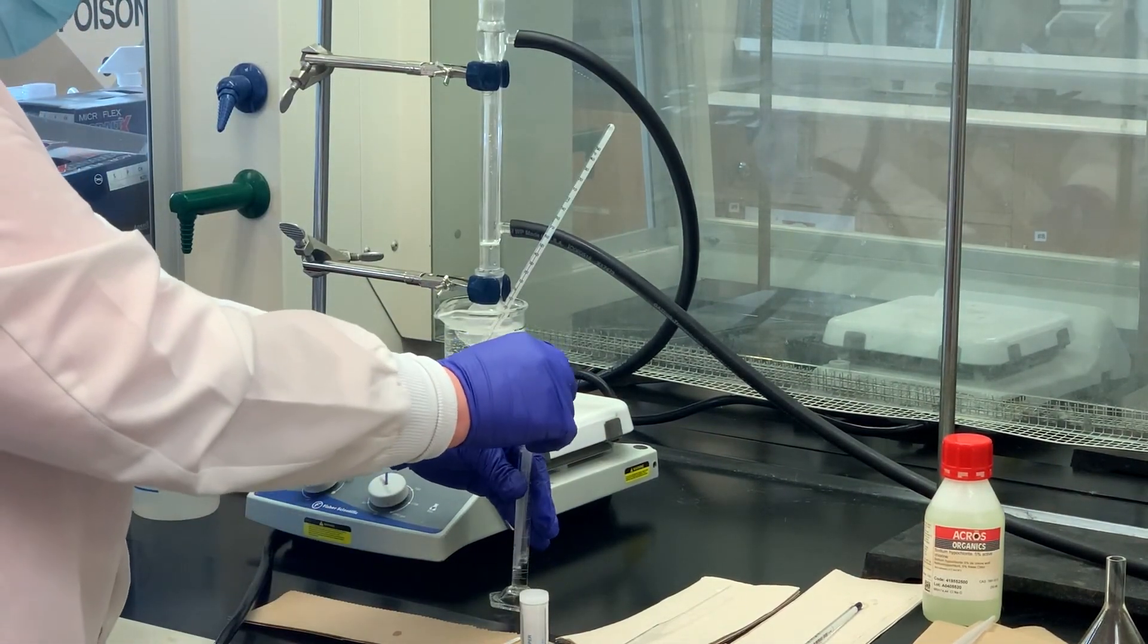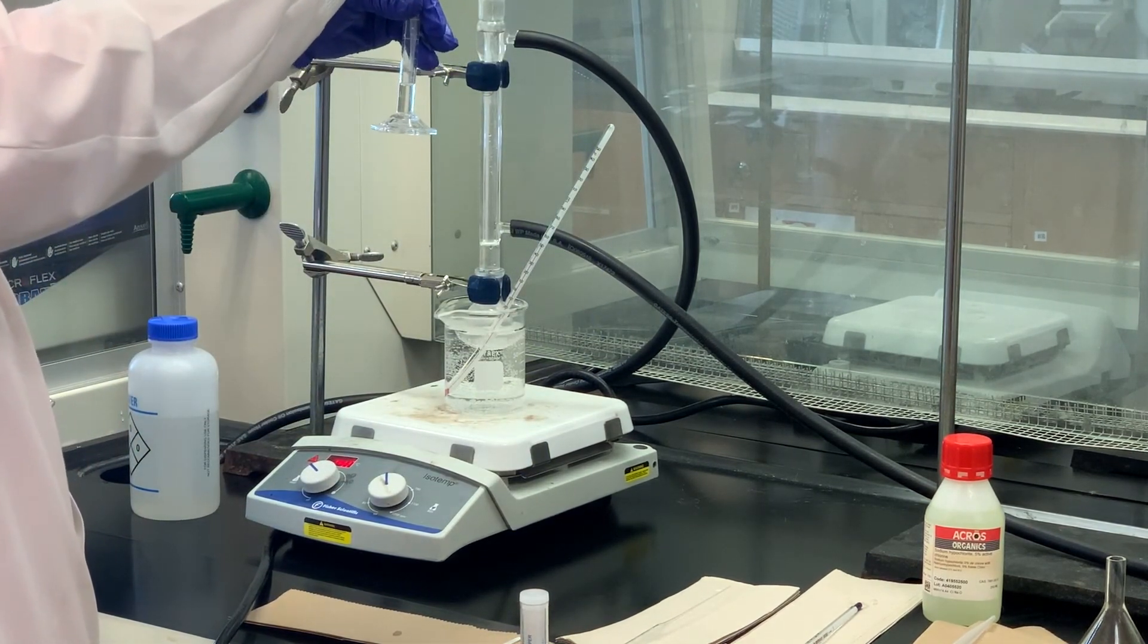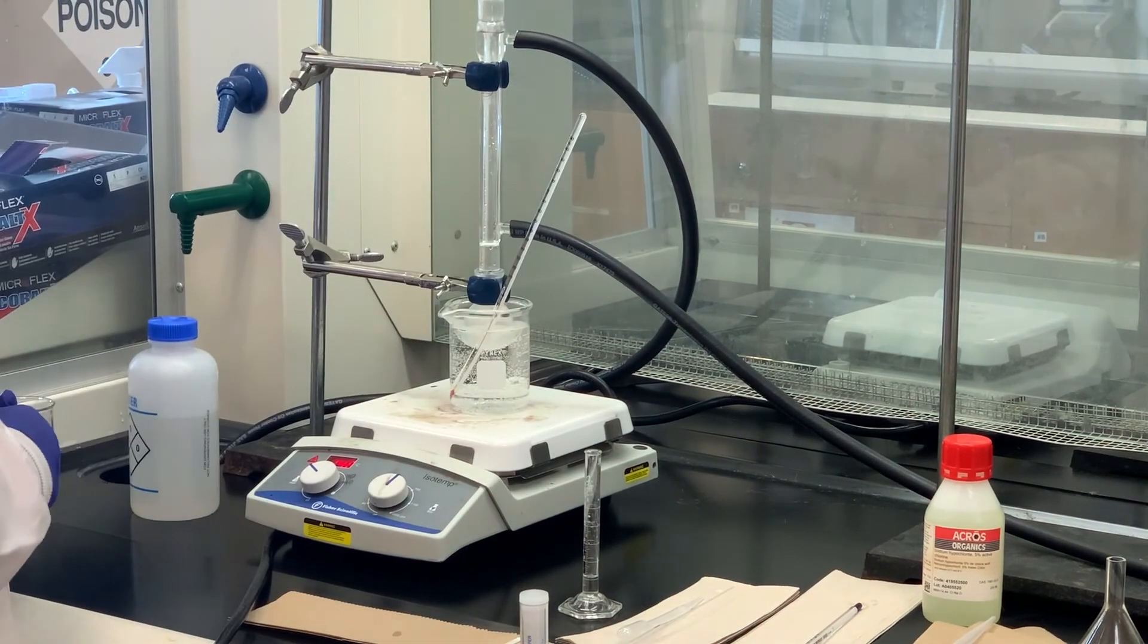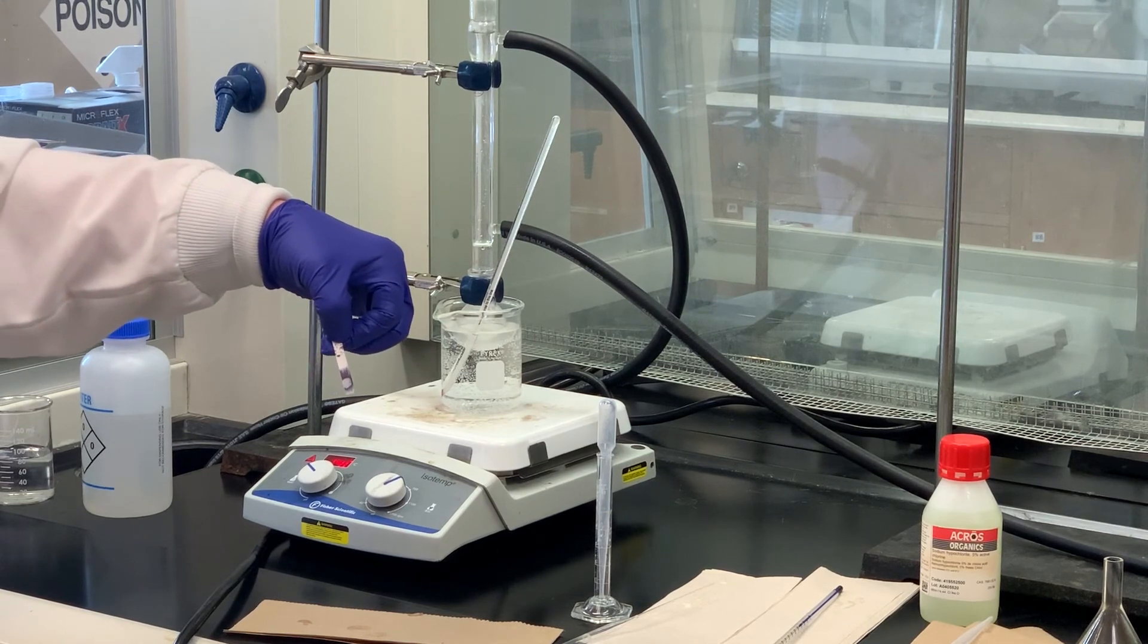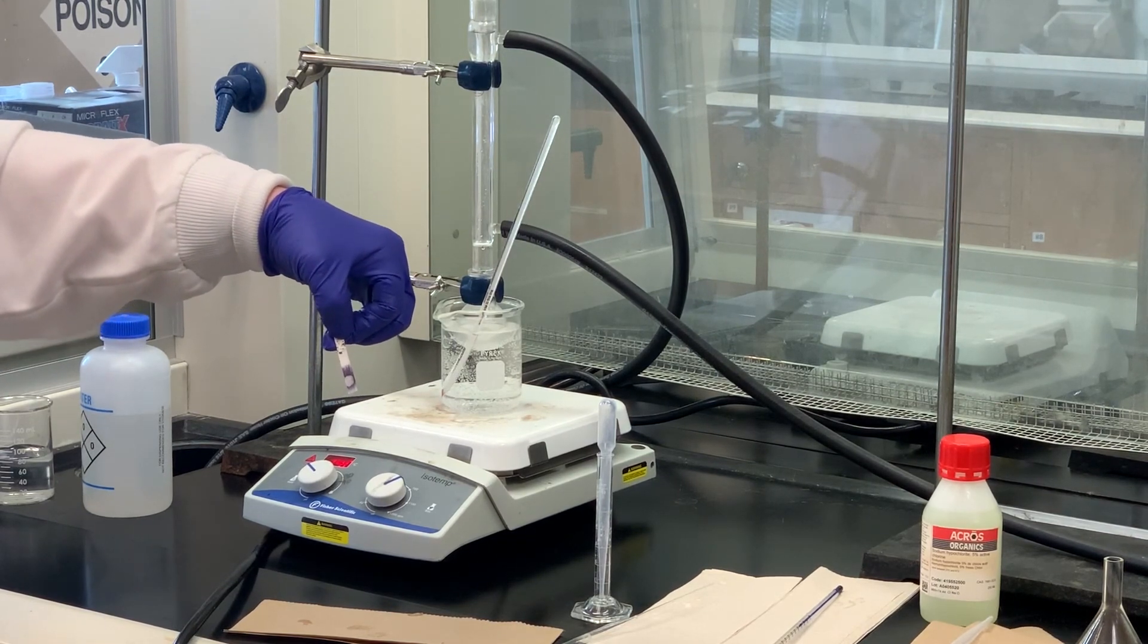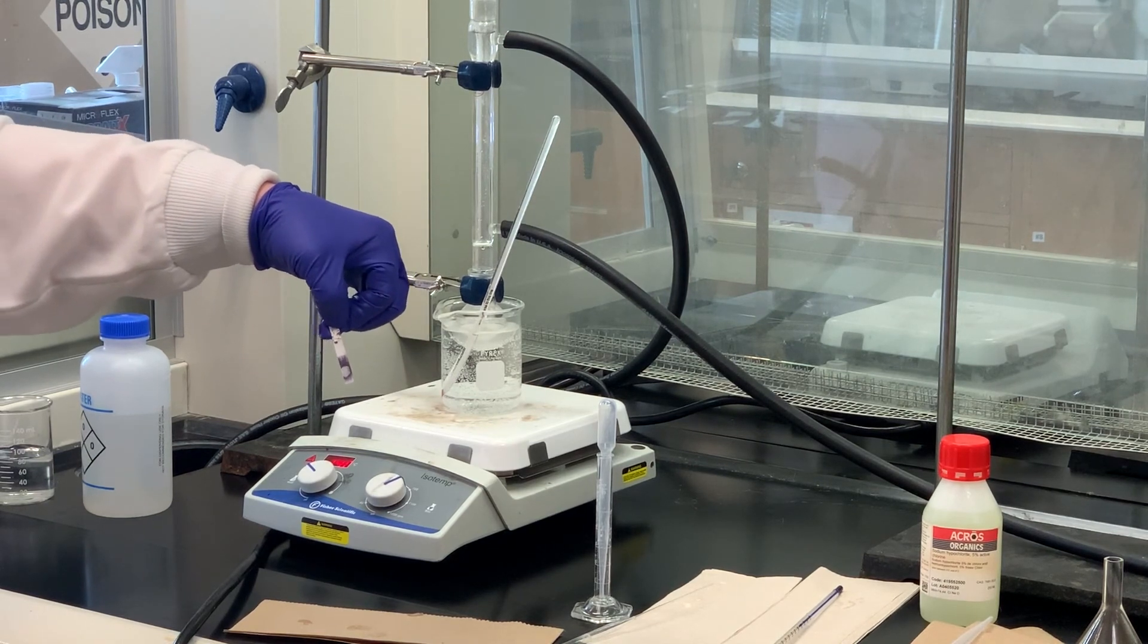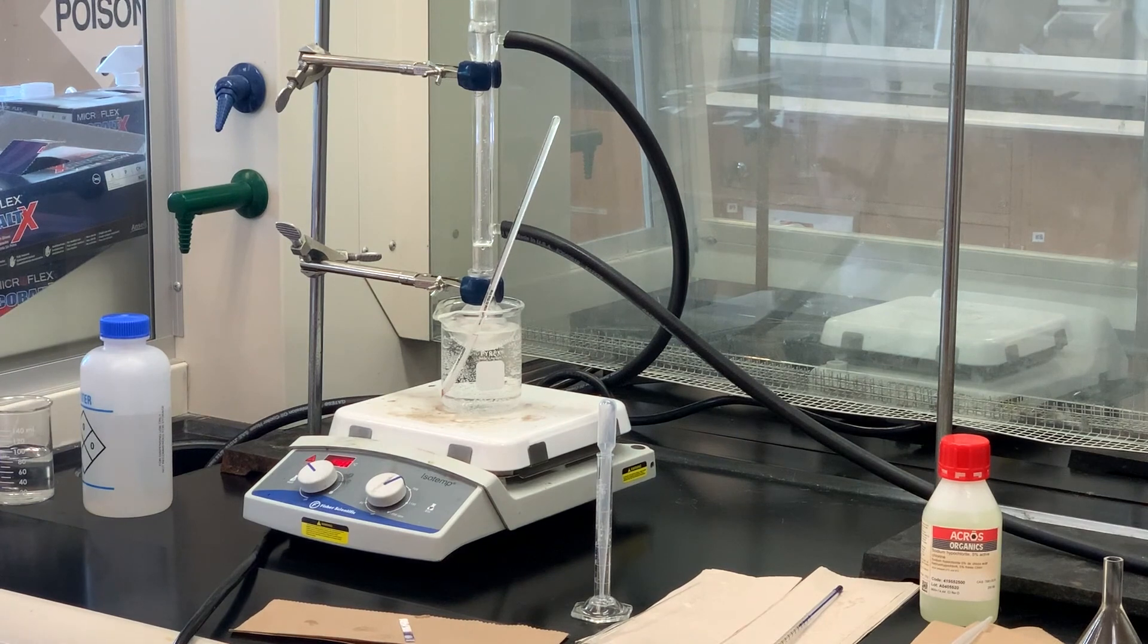Still not a positive test, so I'm going to add another 0.4. And this is after we had to add three different additions of the bleach, but now you can see we got the blue-black response on the starch iodide paper. So now what we're going to do is let that heat another 10 minutes, and then after that we'll let it cool and we'll go through the extraction process.